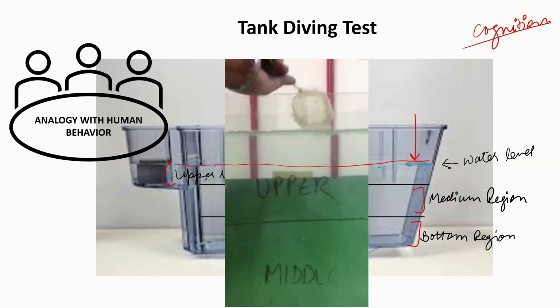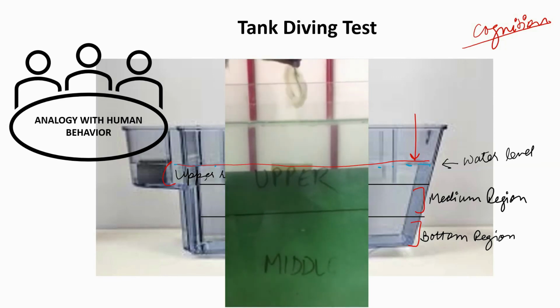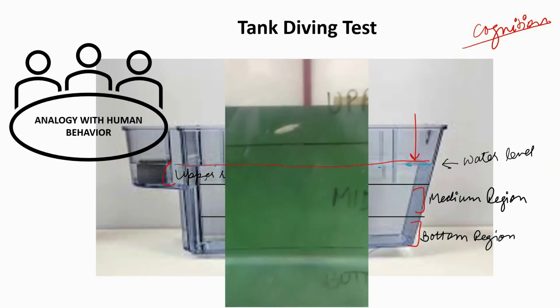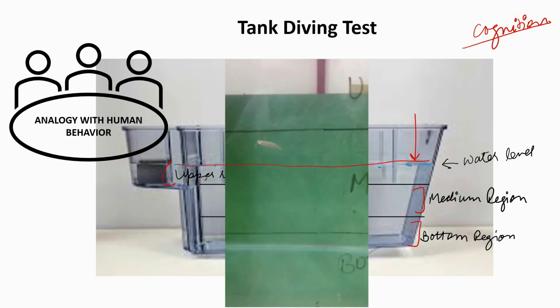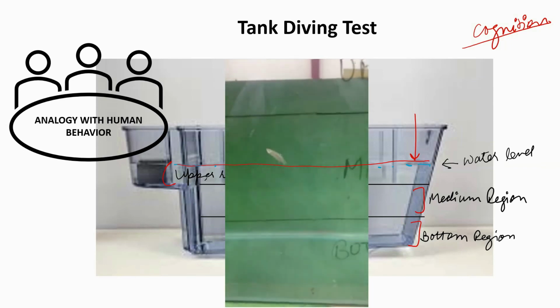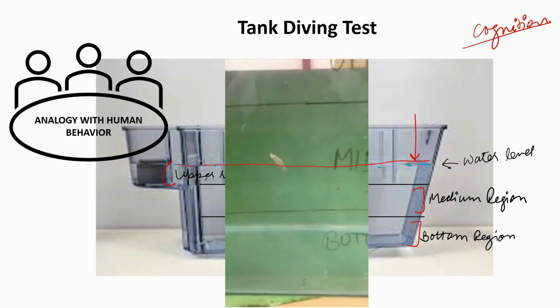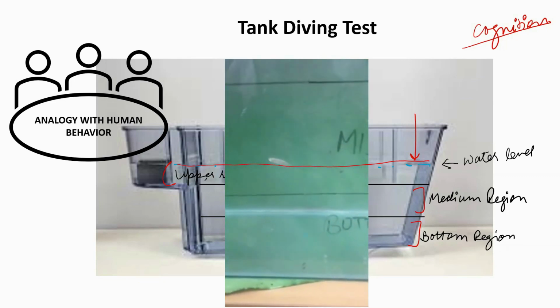Okay, so let us show it to you. Now the subject has gone, and you will see the subject was slowly, freely falling and was really unable to swim. Although the subject will swim eventually, this is what we saw in Parkinson's disease.